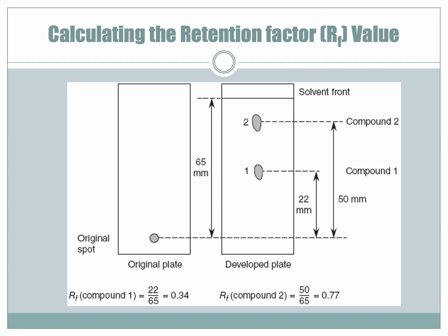And so what this shows us is that our original sample, we took an unknown solid, we dissolved it in some solvent and made a solution, but we didn't know how many compounds there were. We spotted it on the TLC plate, put it in the developing chamber, and then we see these 2 spots. So that tells me that I have at least 2 different compounds in my mixture.